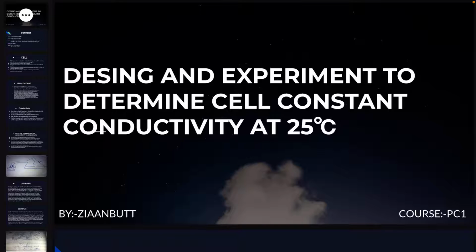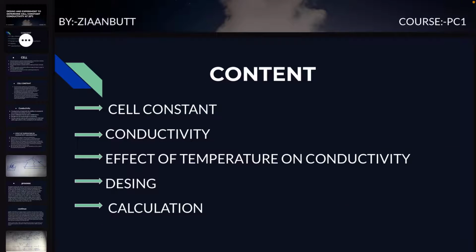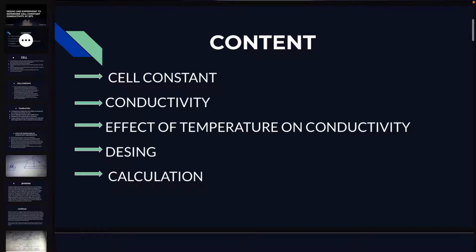So here we have a specific temperature which is given, 25 Celsius. The best salt in a solution that can conduct at 25 Celsius is KCl. So we'll be considering KCl as the salt in the whole presentation.